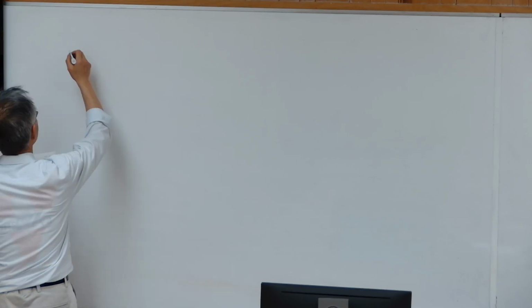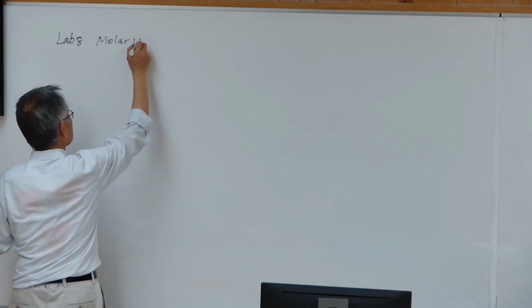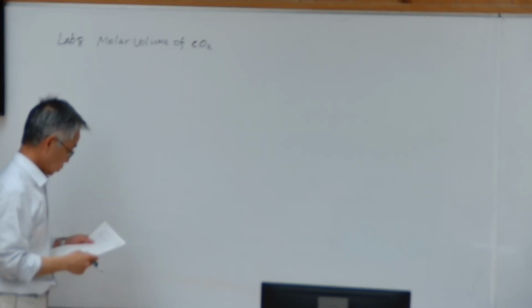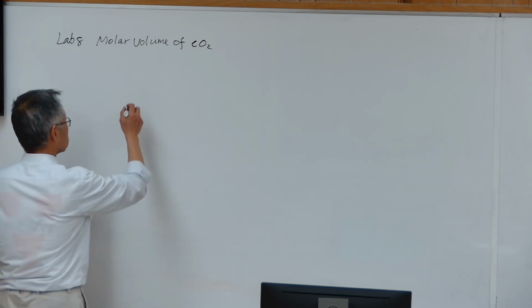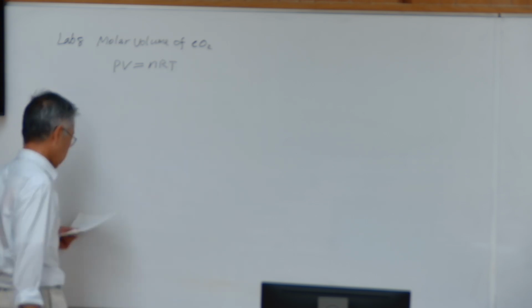Okay, today we're going to run experiment 8, determine molar volume of carbon dioxide. So we will assume carbon dioxide is an ideal gas. So we will have the ideal gas equation PV equals nRT.